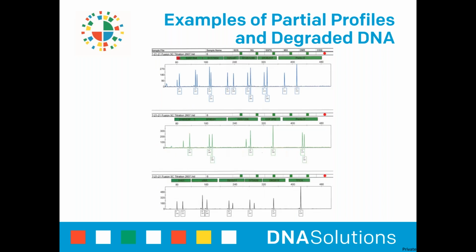Here's an example of a partial profile that is suitable for comparison. For instances like this, your client would still be provided a report. However, the report would indicate which markers were not included in the statistical analysis due to the peaks not meeting the laboratory threshold.